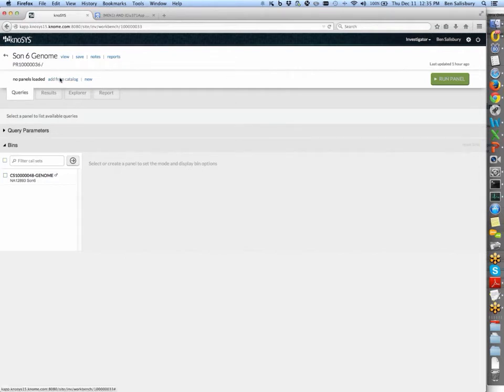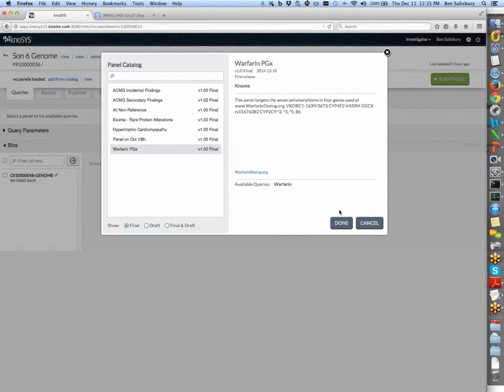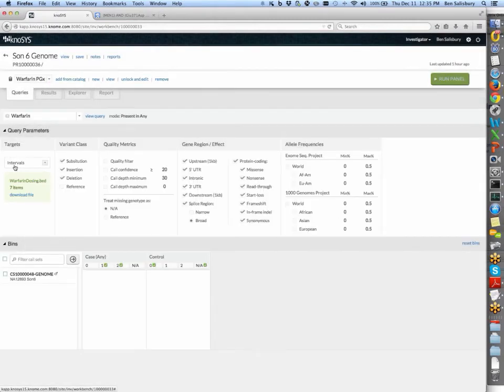We're going to go to our catalog, and choose our warfarin panel, which I've set up to query those 7 variants. So how is that done? This time, instead of searching by the category of genomic element or by choosing a list of particular gene transcripts, I loaded up a bed file, which is a simple file with the chromosomal positions of interest. Those could be broad regions of a chromosome or a gene. In this case, it's pinpoint locations of these 7 variants.